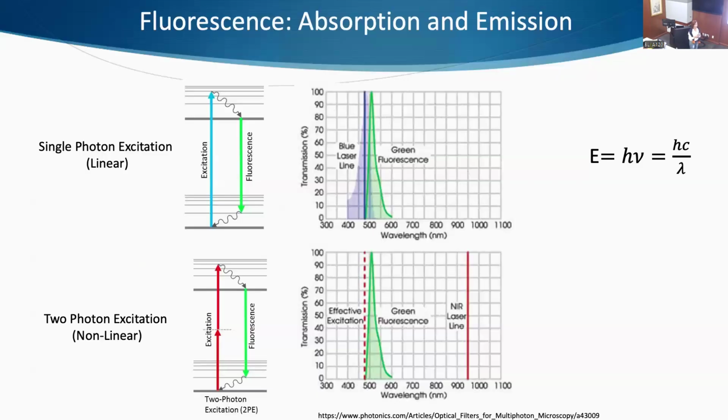For the single photon excitation, Brenda, can you, for the sake of the recording? Can we use an IR for the single photon excitation too? Most molecules have the absorption in the UV. You could design molecules to be excited at longer wavelengths, but probably most of the molecules of interest are in the UV.